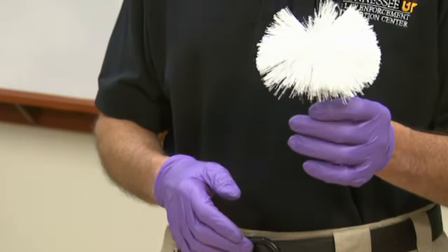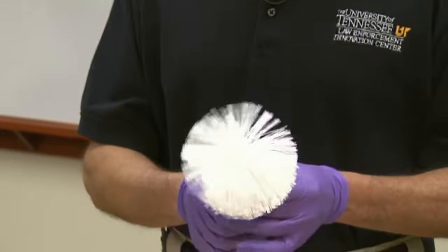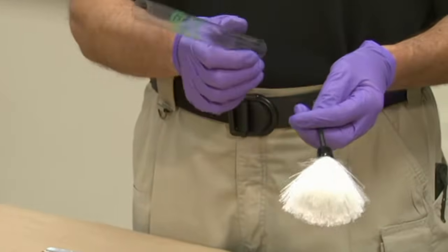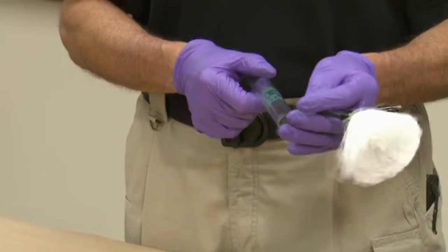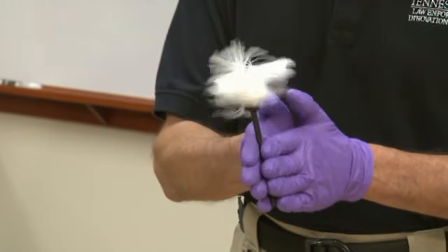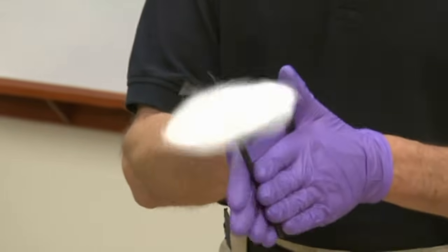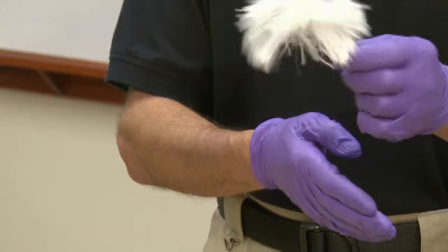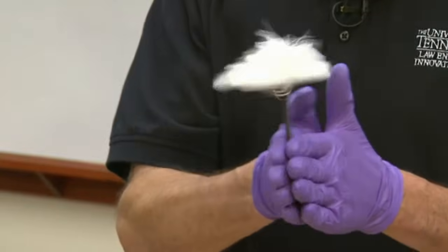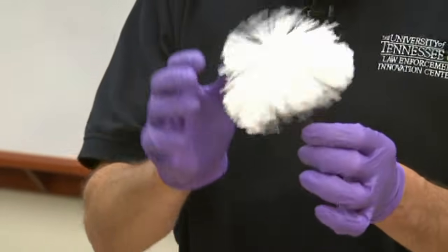When you take out a new brush — this is a new fiberglass brush with numerous filaments — this is not the way we want it to appear when we get ready to load it with powder. This is how it comes out of the container, and this is also how we recommend you store it. When you take it out, you break it in by spinning it like this, and we want it to open up and appear more like a dome.